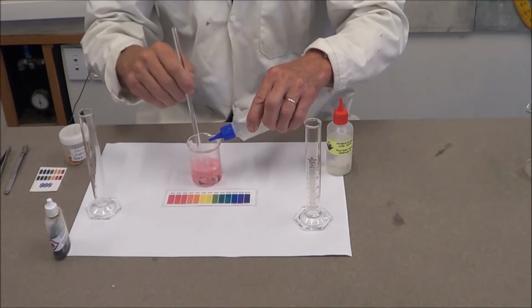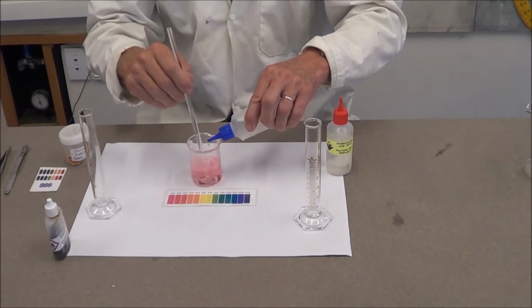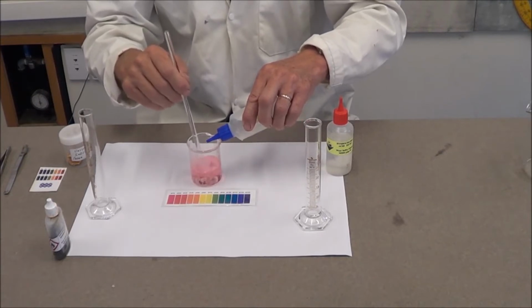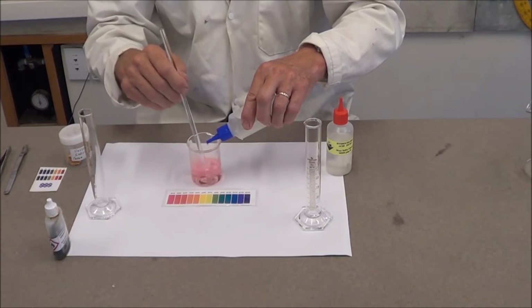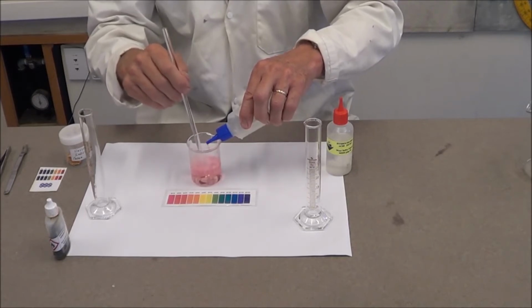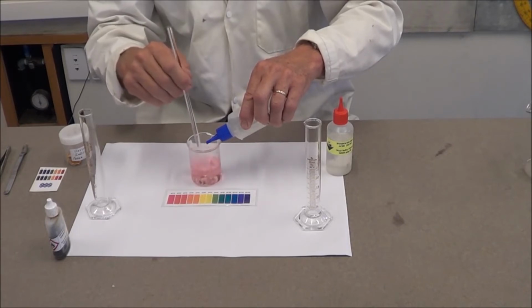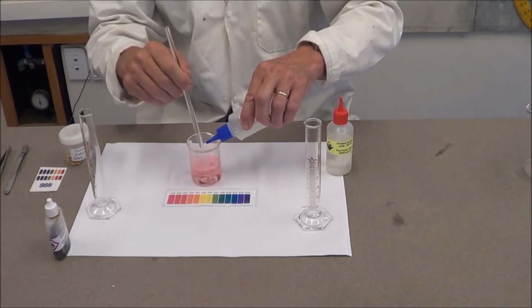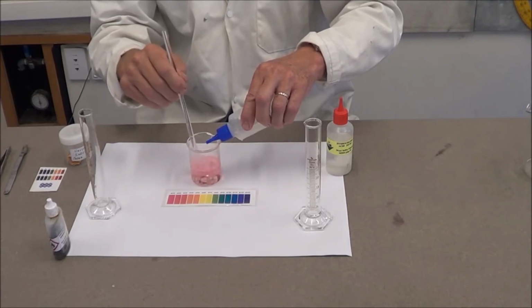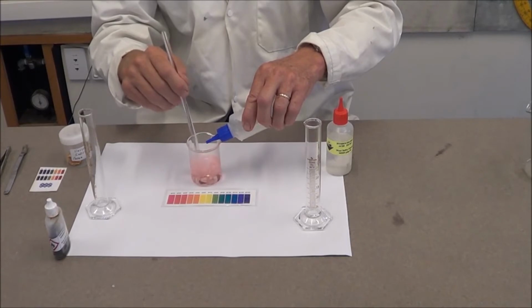Again, note any colour changes that occur along the way, as you may be required to explain what is causing the colours to change, in terms of the acid particle, the hydrogen ion, and the base particle, or hydroxide ion. Notice that the changes are occurring now. We have to slow right down, as one drop can in fact make quite a difference.